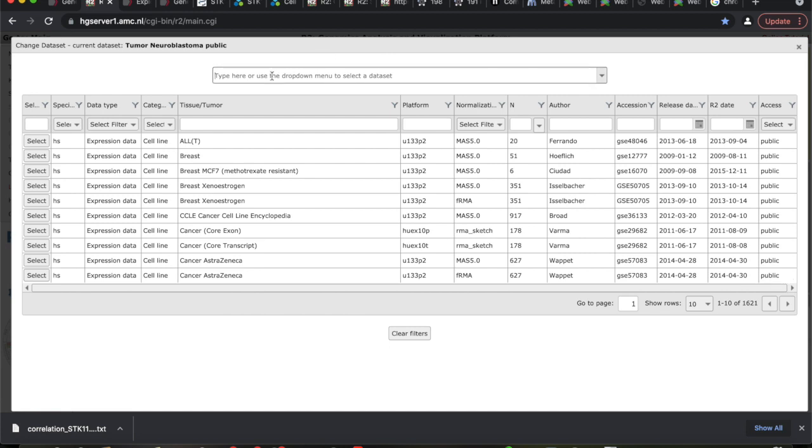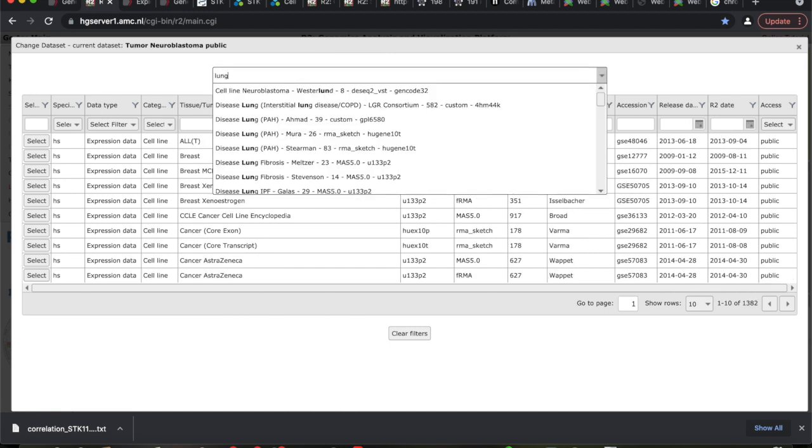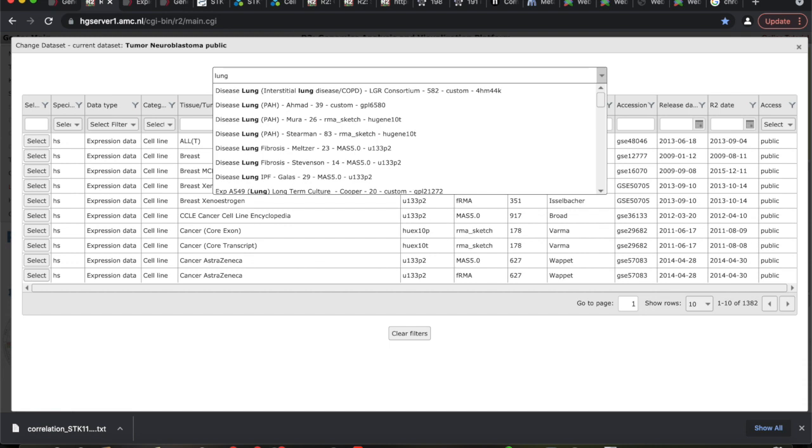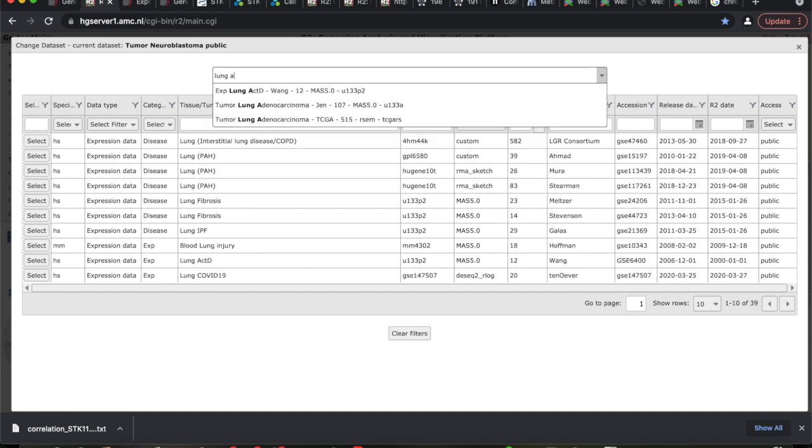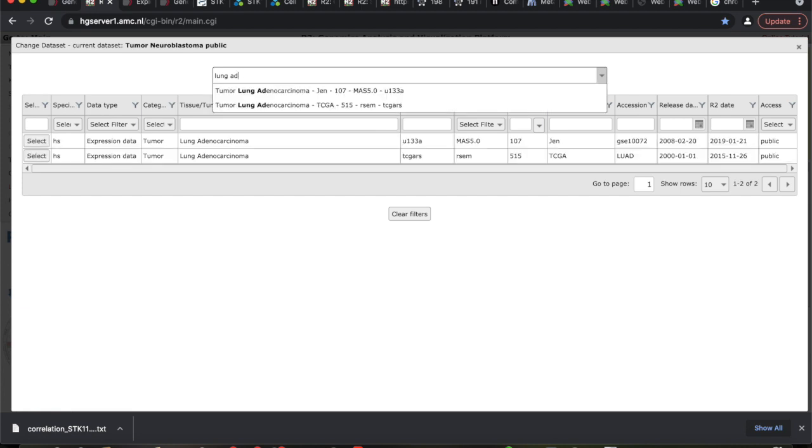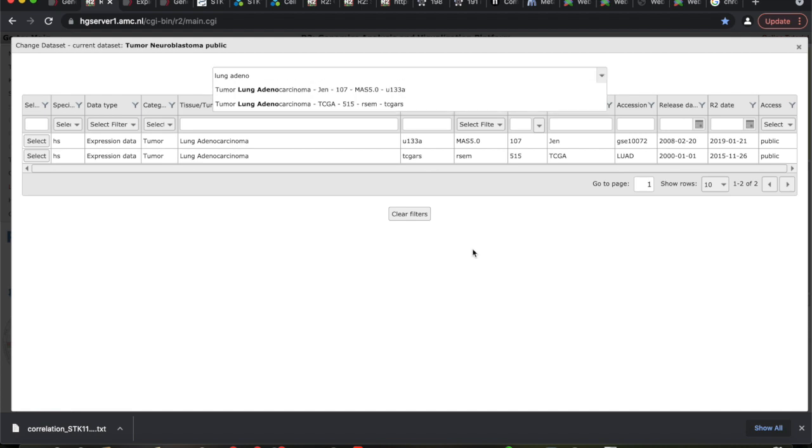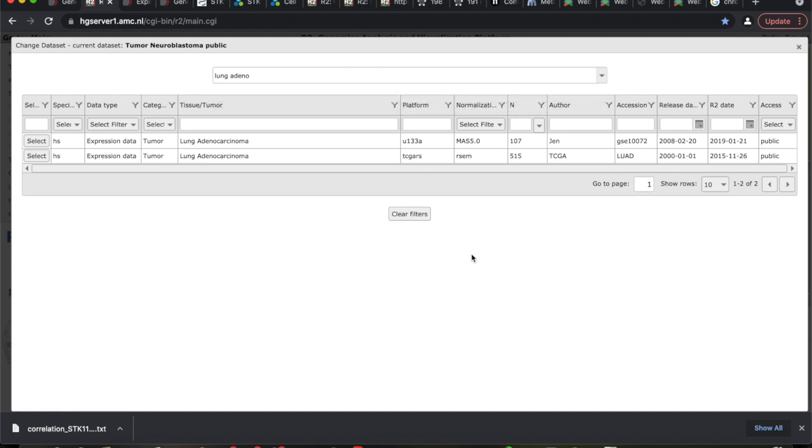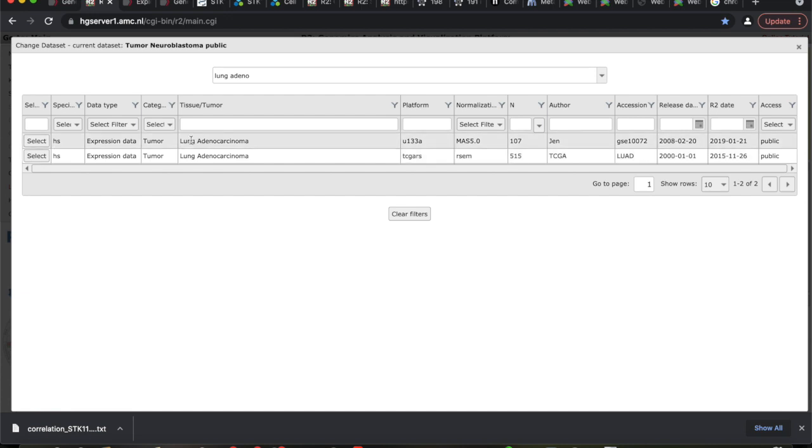Here's what I want you to do is type lung and then space adeno. As you type that you should only now have only two things to select from. These are different databases in their larger database, sub databases in their larger database.